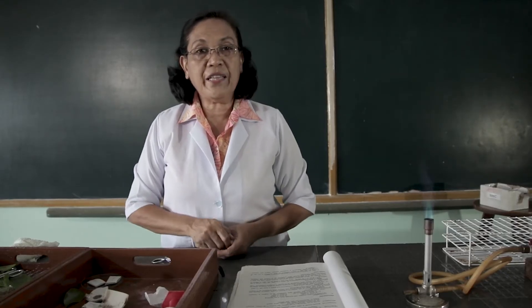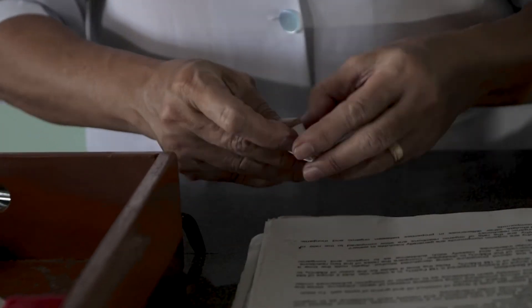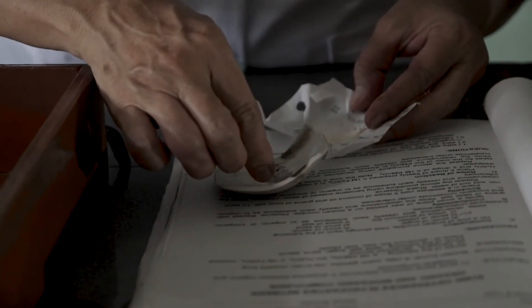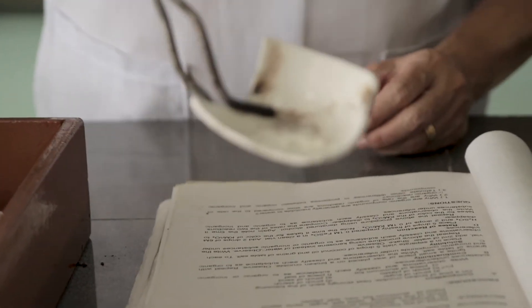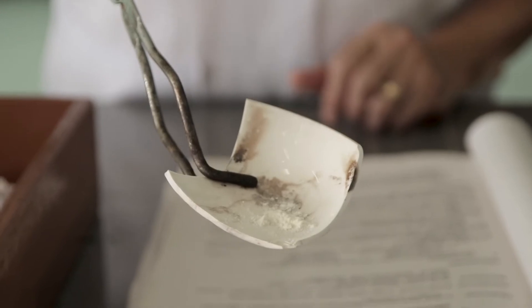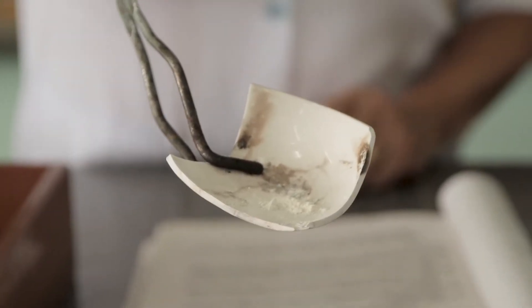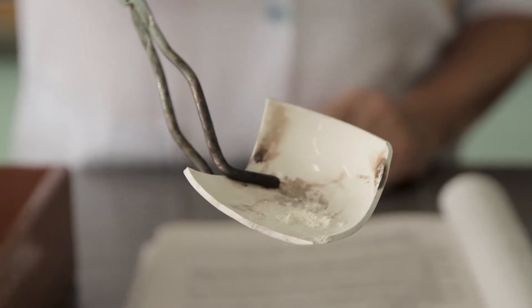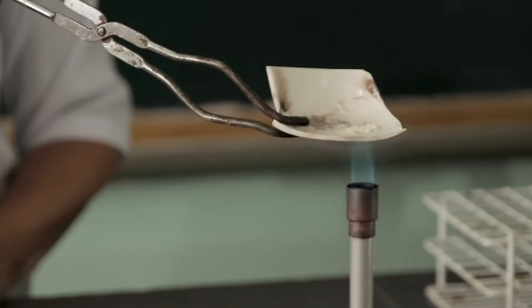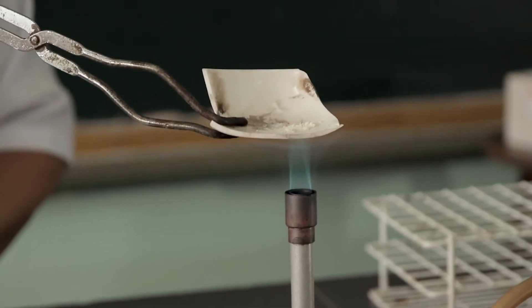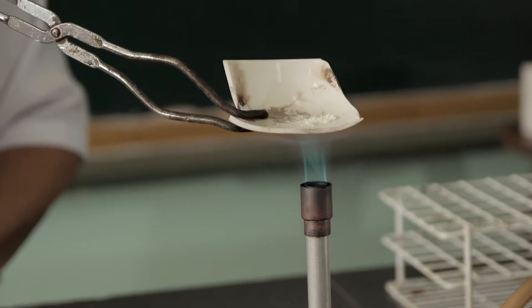Then we're going to heat a pinch of starch. This is the pinch of starch. I want you to observe the color before it is being heated. So let's heat it over the flame and observe what happens to the color.